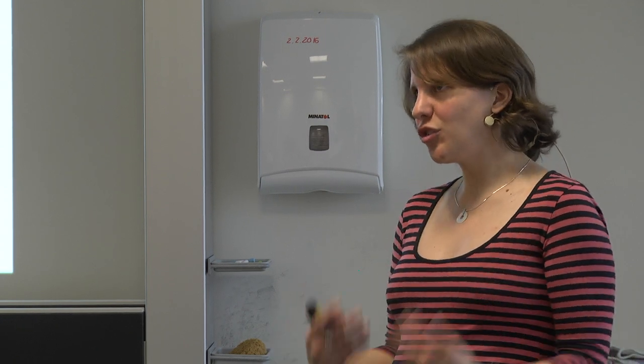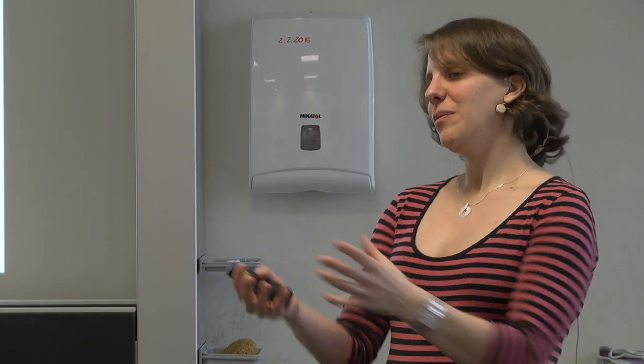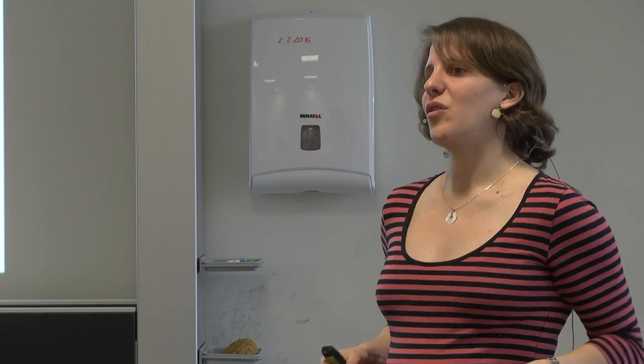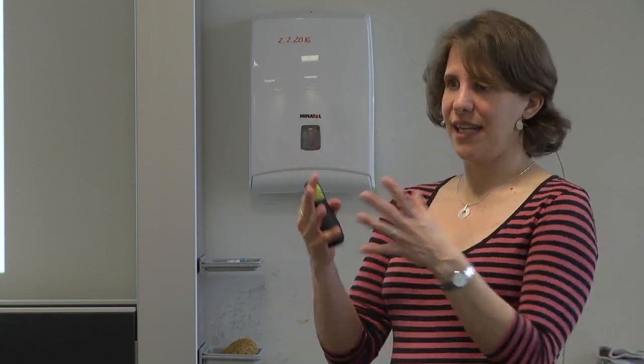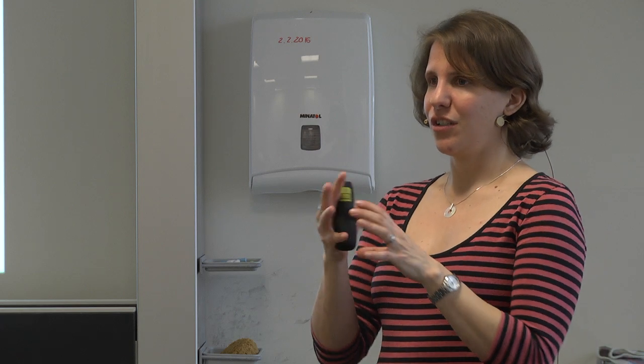And I'm usually always a fan of putting more data points in, so not to throw out outliers, but rather to keep all data points and to somehow combine this information. Taking the median, taking the average are all options. Even better is to also take into account how reproducible a peptide is, how well it is scored, to combine all of this information into a final ratio as well. And there are software tools out there that were designed to deal with this problem, and you will learn a bit more about them throughout the week.